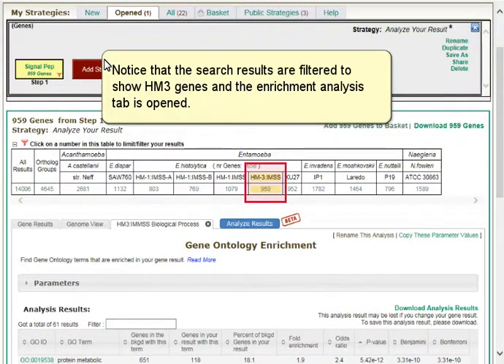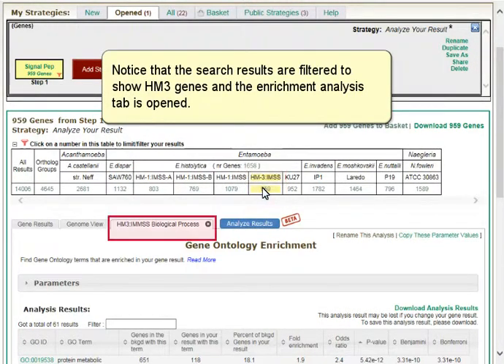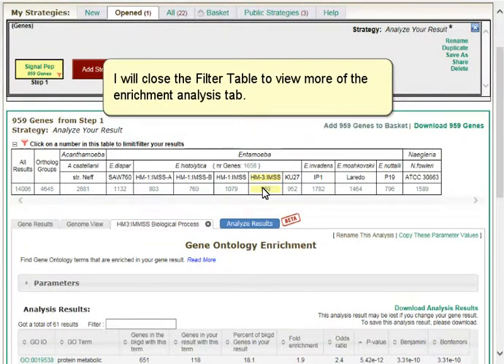Notice that the search results are filtered to show HM3 genes, and the Enrichment Analysis tab is open. I will close the filter table to view more of the Enrichment Analysis tab.